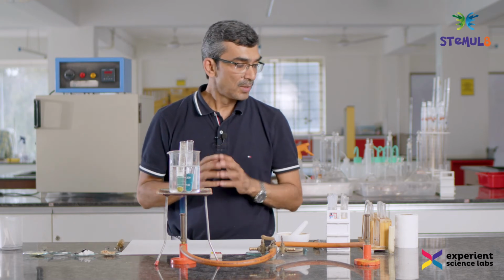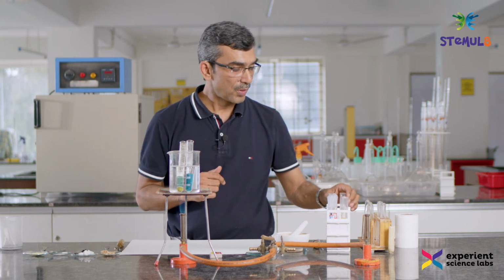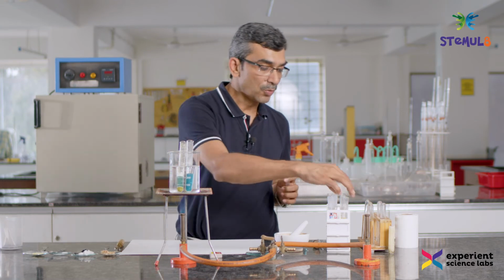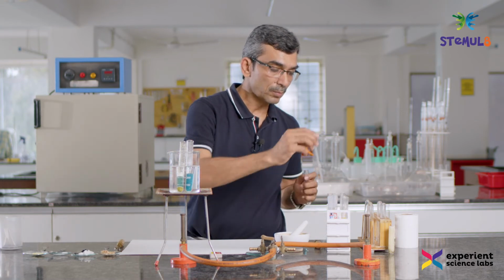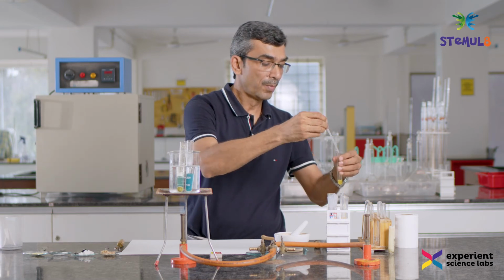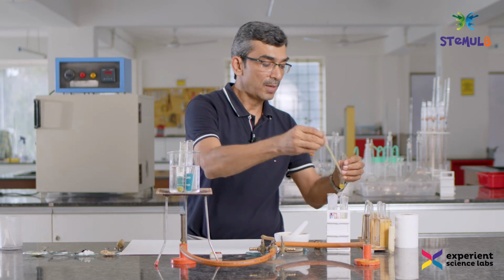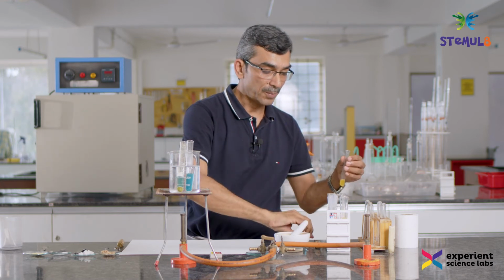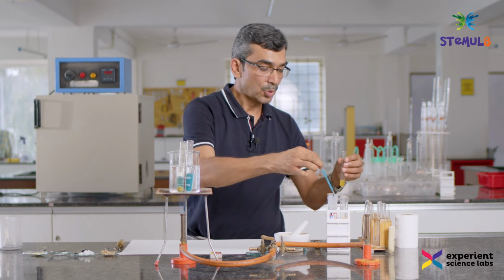Just to add to the mix and the fun of it, I will also take in a smaller test tube a bit of this packaged fruit juice and test how it compares with the sugar solution.